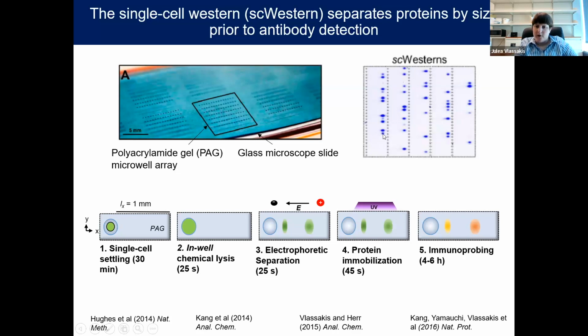But here you can see some protein bands that are present. And much like a conventional Western blot, if you measure relative levels of the protein species with a densitometry type approach, in this case, it's automated and in MATLAB, and that code's available on GitHub. And I'm happy to talk about that analysis since I helped design that analysis pipeline.